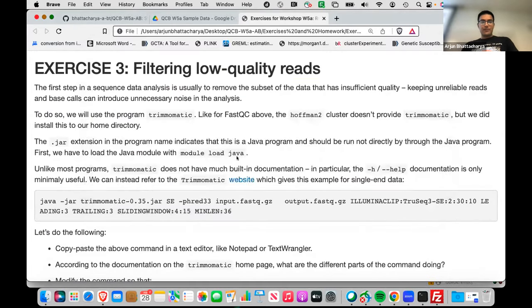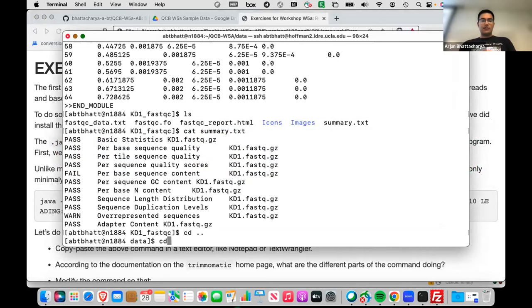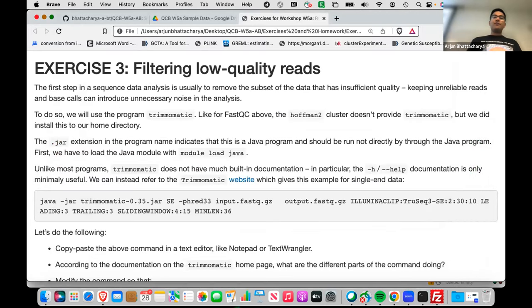All right, the last thing we'll do today is filter out low quality reads. If we have certain reads for a sample, we can trim them. If there's bad sequencing at the ends of reads, you can shorten the read and say, okay, the middle 71 base pairs here are what we need, and use that to run our alignment.